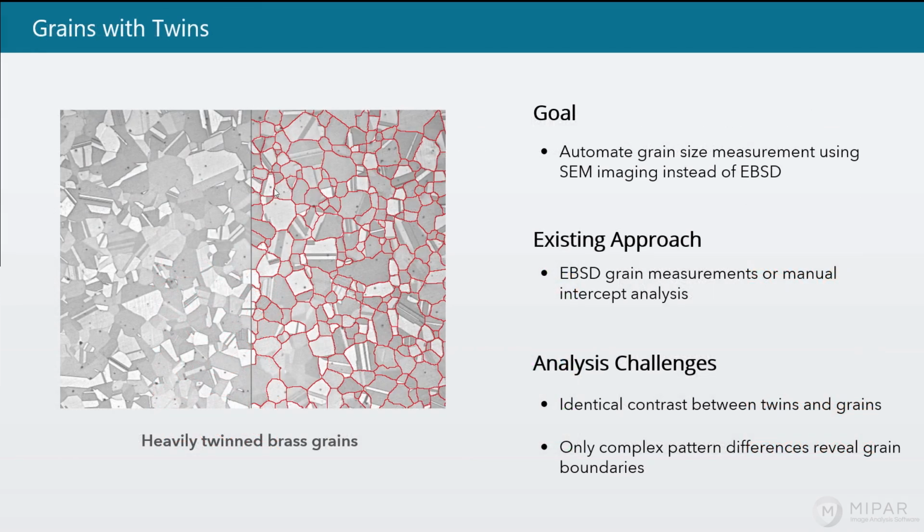In this case, we have an SEM image, in fact, a series of SEM images, which reveal a grain structure. As I've mentioned, the grain structure is a heavily twinned one. Each of these strips and very linear features represent a twin boundary within the material's grain structure. These represent slight variations in crystal orientation within a single grain.